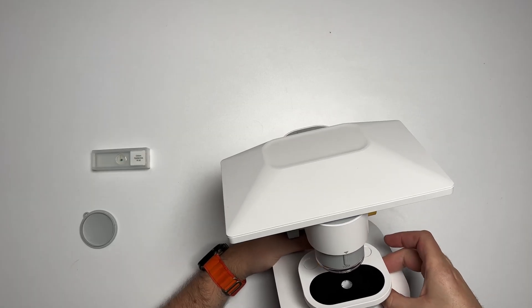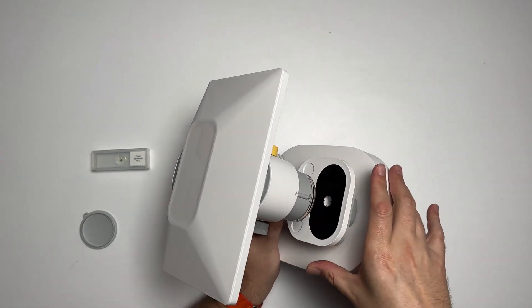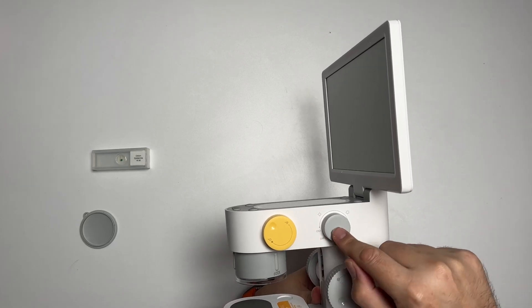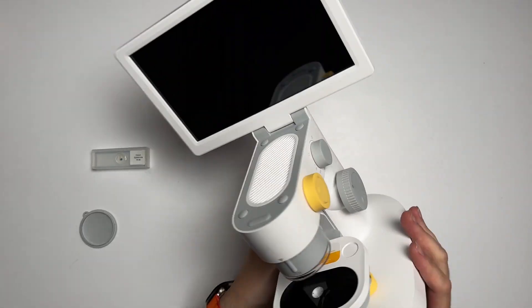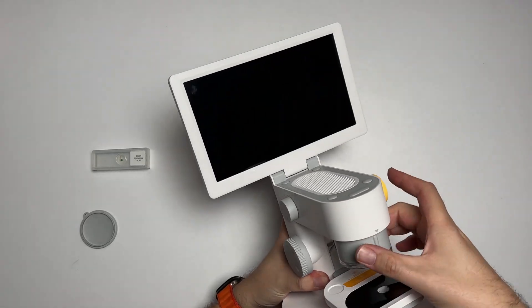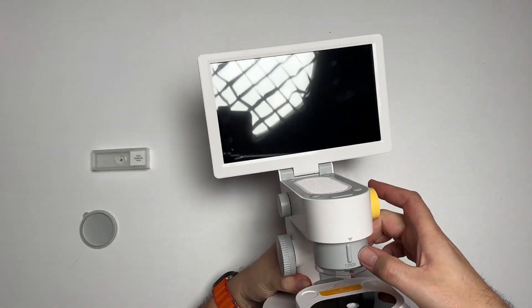This one has a nice large digital display. The little platform here is movable — there's these little yellow knobs and you'll be able to slide it front and forward and side to side. You also have your focus knob and you have a light. There's two different lights actually — a light that faces downward and a light that comes upwards, and there's a knob for one and a knob for the other. This one does 100 times, 600 times, and 1,200 times magnification.